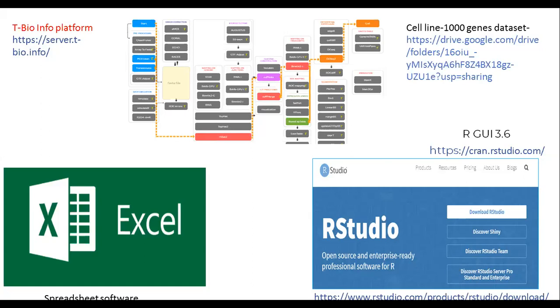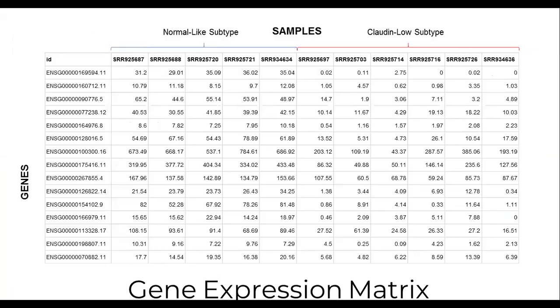So we created a gene expression table. You can see this green button there, the algorithm we used to create it. When you open it, it's a TXT file that can be opened in Excel, and it would look something like this. You don't have to open the data sets we provided just yet. For this moment, let's just review what a gene expression table looks like and what it's composed of.